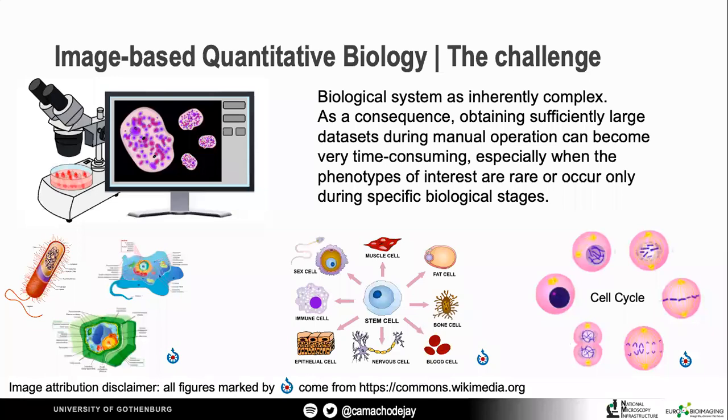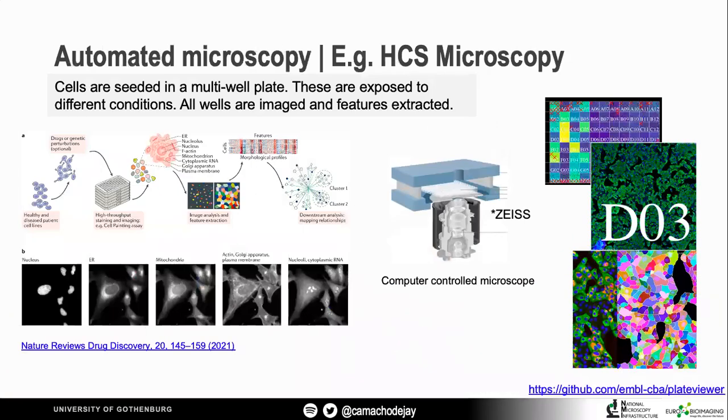So there is a lot of variability, and depending on how common the phenotype that we're looking for is in our system, we might have to expand the libraries longer and longer, because we need to be able to catch that very uncommon event that occurs within thousands of cells, right? So this is one of those things: we are going to have to handle rare events. Our pipelines usually have some sort of baseline, and what we're aiming for is finding those rare events and trying to understand why they happen.